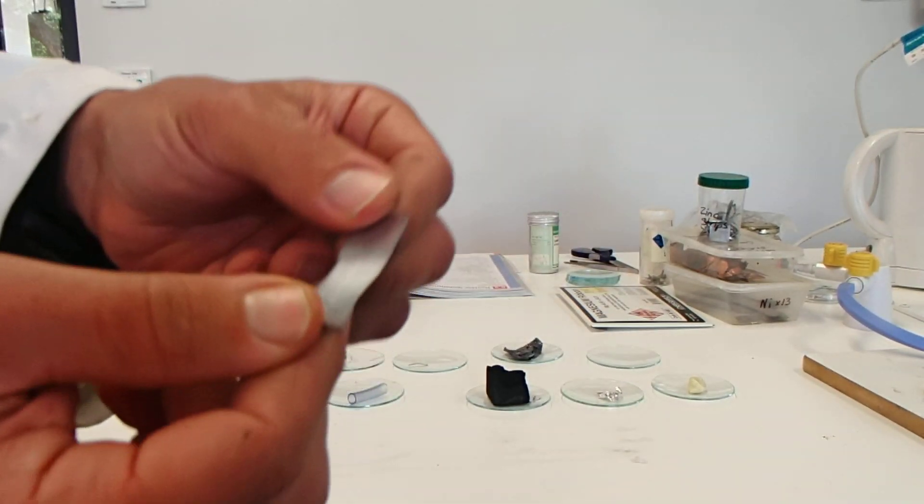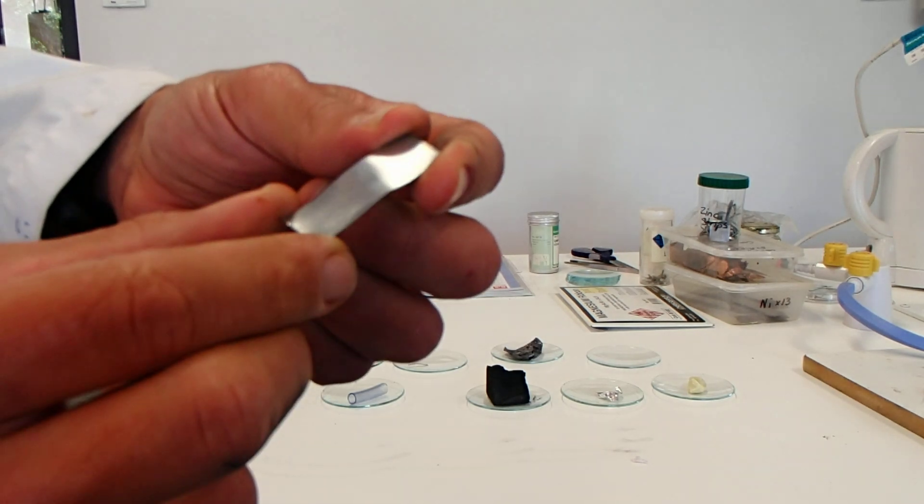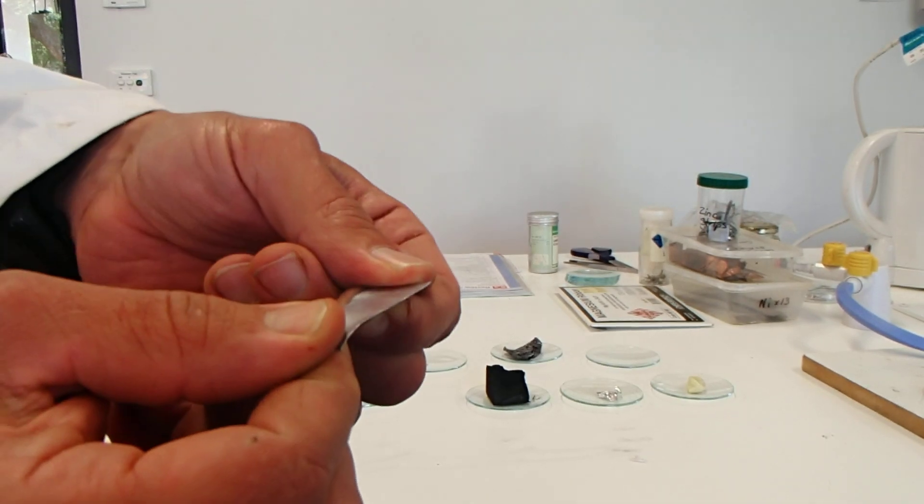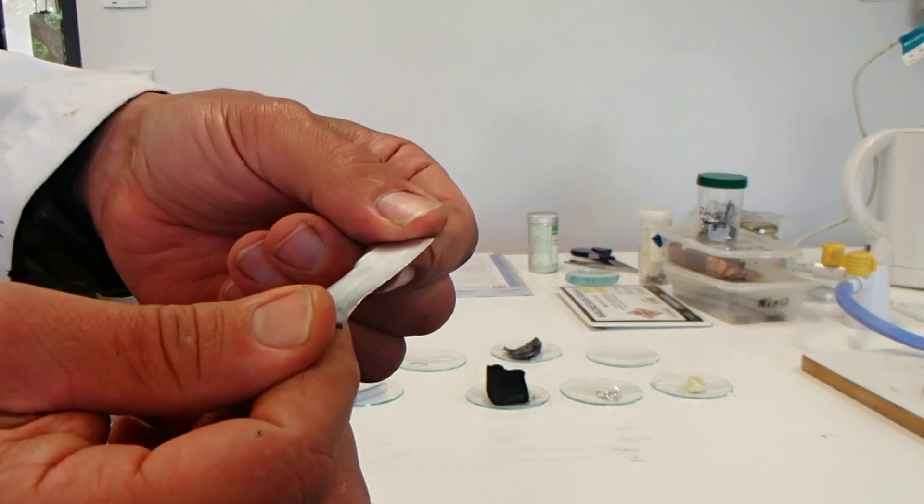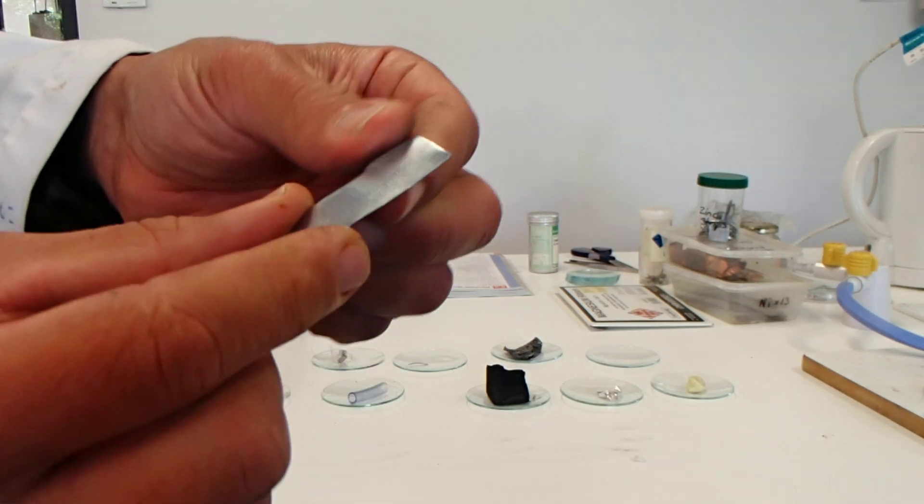Next we have zinc, almost the same as tin. I'd say more shiny, more blue in color, a little bit brighter silver, a little bit shinier, still light in weight. So that's zinc.